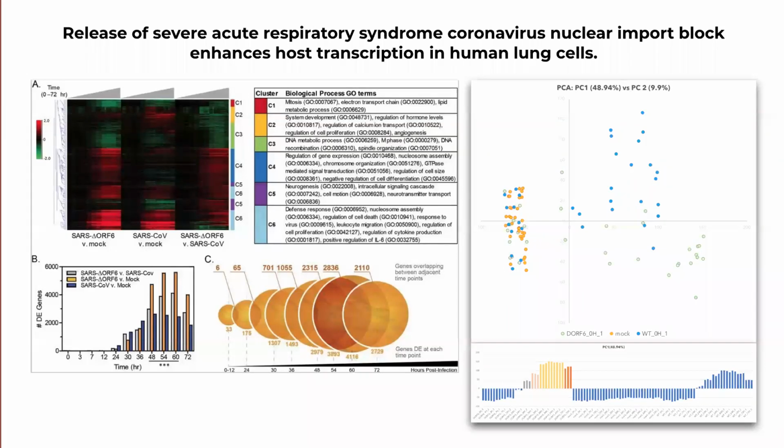They had a pretty unique experimental design. The Calu3 cells were infected with either icSARS-CoV or the icSARS Delta ORF6 mutant. The sample cells were collected at various intervals in the post-infection phase, and then each infected sample was done in triplicate. Triplicates are defined as 3 different wells, which are plated at the same time, using the same cell stock for all replicates. There are triplicate time-matched mocks for each time point from the same cell stock as the rest of the samples. And then the culture medium, which is the same as what the virus stock is in, was used for the mock infections.